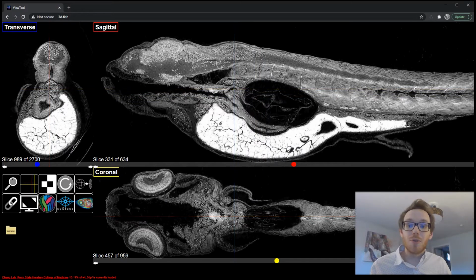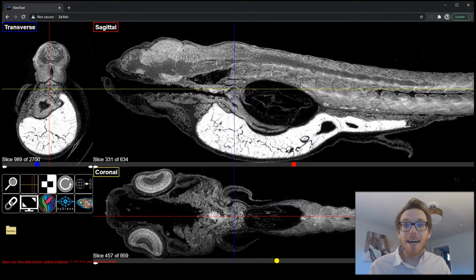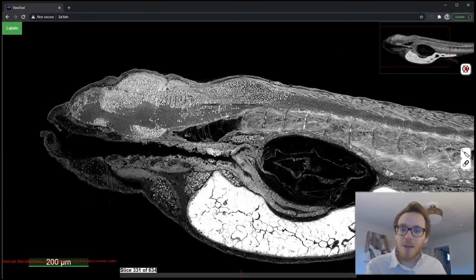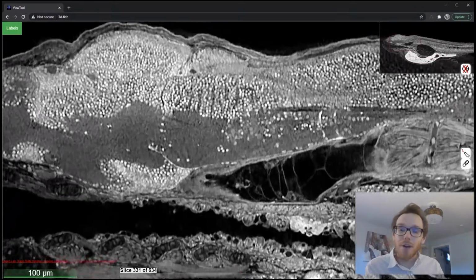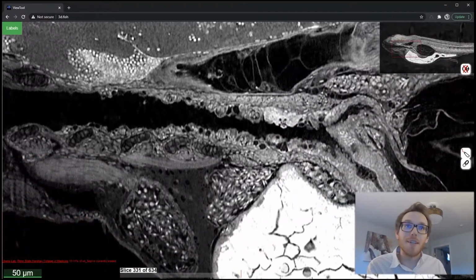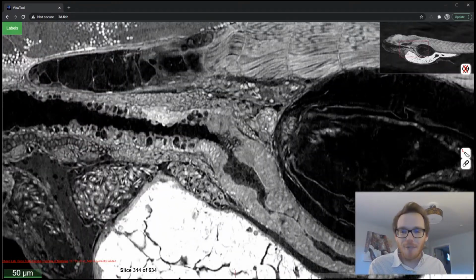So I'm just clicking through the included functions, which include inverting the color space and zoom. If you click zoom, it will load in a high resolution image of whatever cut plane you'd last clicked on. By default, in that multiplanar view, it loads in some very, very downsampled images, about a fifth of the data set total.